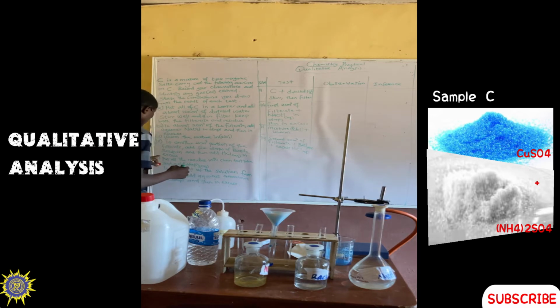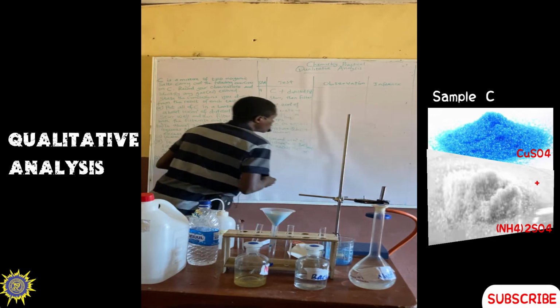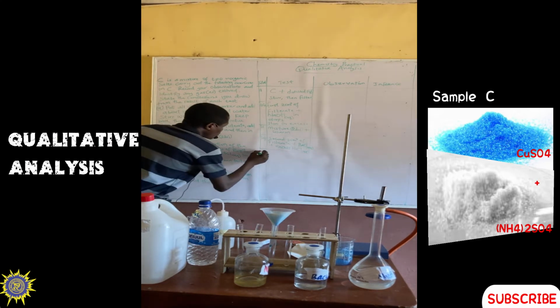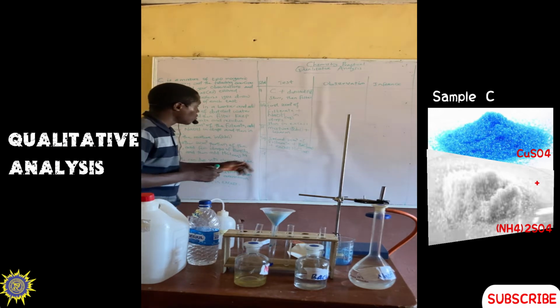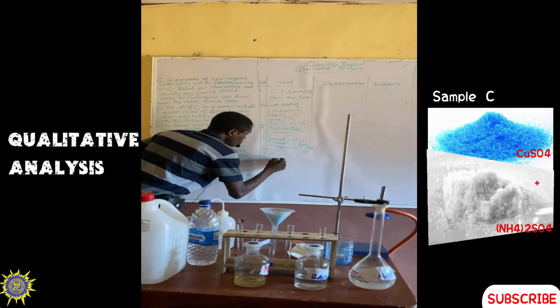Then you write the word observation as well. Then the next one is C, Roman figure 1. When you are talking about C Roman figure 1, you have to put all the residue into a clean test tube and add HNO3. So C plus HNO3.